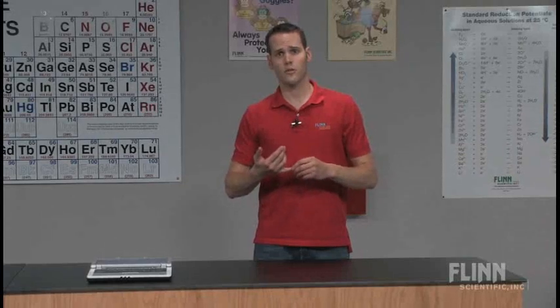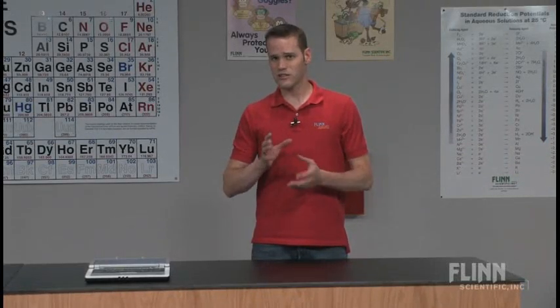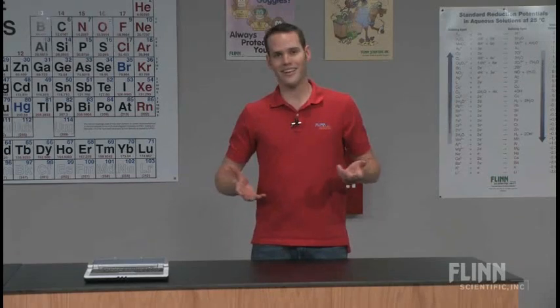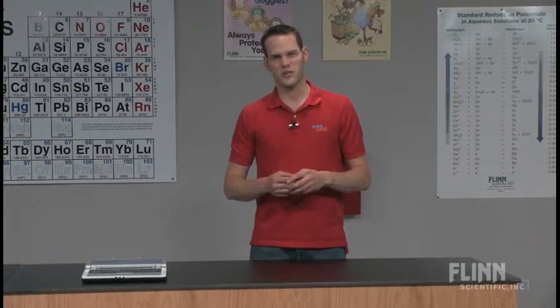The other thing that you have to watch is when you're using methylene blue, some plastic containers, the ones that are sort of translucent, I think the polyethylene, can sometimes absorb the methylene blue. The methylene blue is a biological stain, and you are a biological person, and it will stain you as well as everything inside of your bottle. So sometimes you might want to use gloves to make sure you don't get any methylene blue on your skin, just so you don't get a stain.